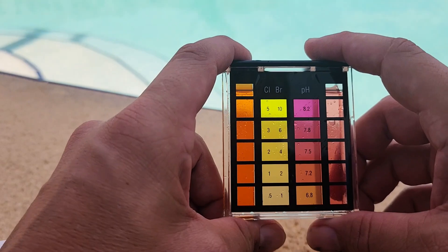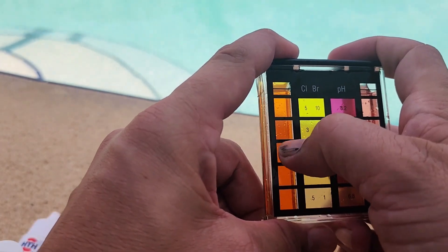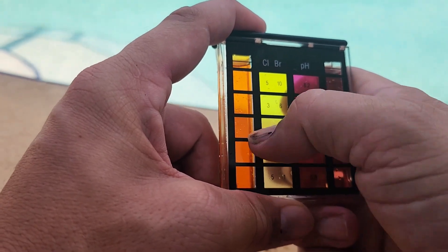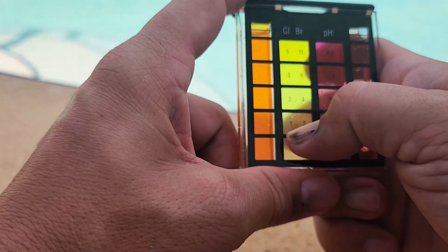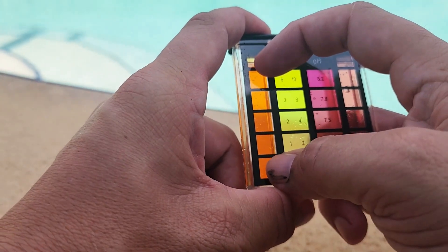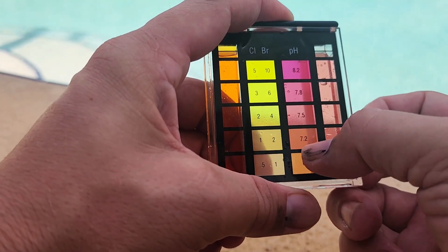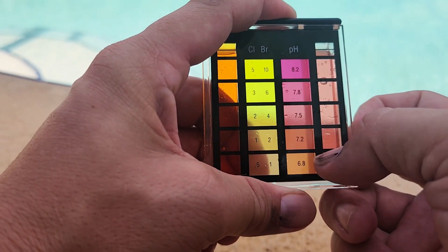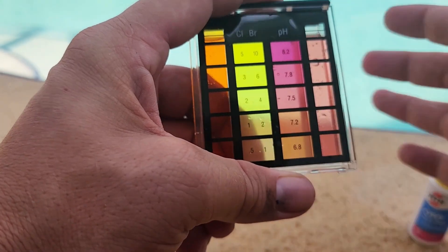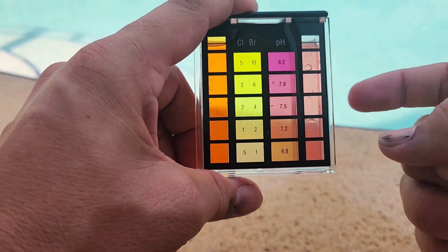I'll go ahead and tell you that my pool is kind of out of whack right now. I had a lot of algae issues and I've been running the pump a lot with my chlorine level super high. It's orange because it's around 10 parts per million, and this chart only goes up to 5 — otherwise it would be yellow and you could cross-reference. You want to keep chlorine between 1 and 3. On the other side, you can see this is around 7.2 for pH, which is fine — you want to keep pH between 7.2 and 7.8.